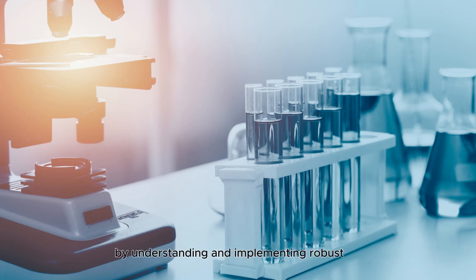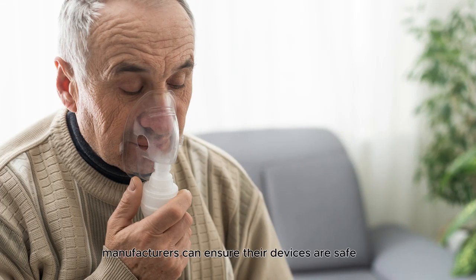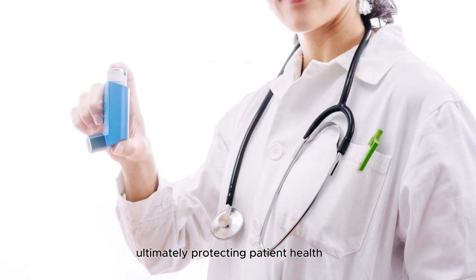By understanding and implementing robust E&L testing protocols, manufacturers can ensure their devices are safe, reliable, and ready for clinical use, ultimately protecting patient health, enhancing the quality of healthcare, and reducing the reliance on animal testing.